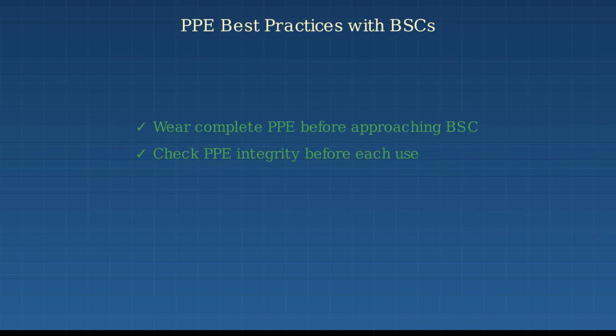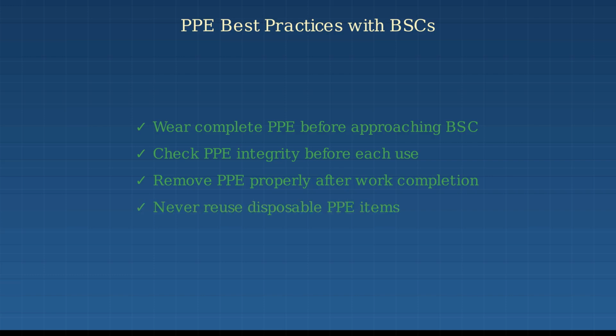To summarize best practices, always wear complete PPE before approaching a biosafety cabinet. Check PPE integrity before each use. Remove PPE properly after completing your work, and never reuse disposable PPE items.